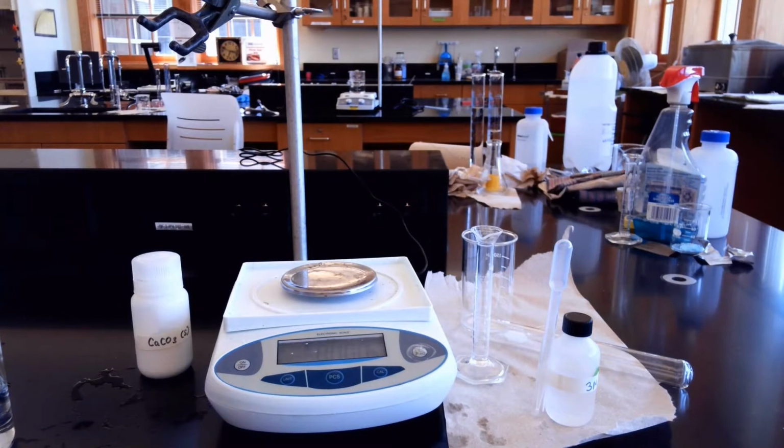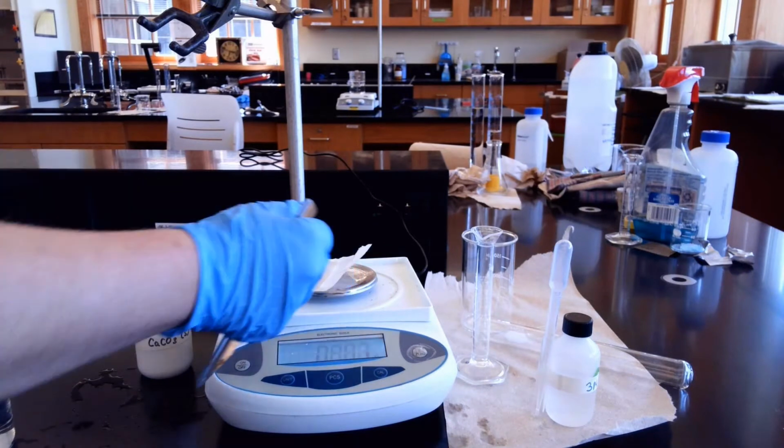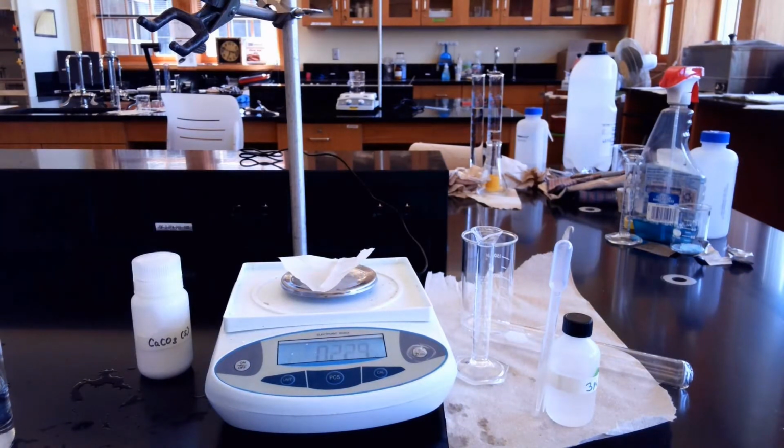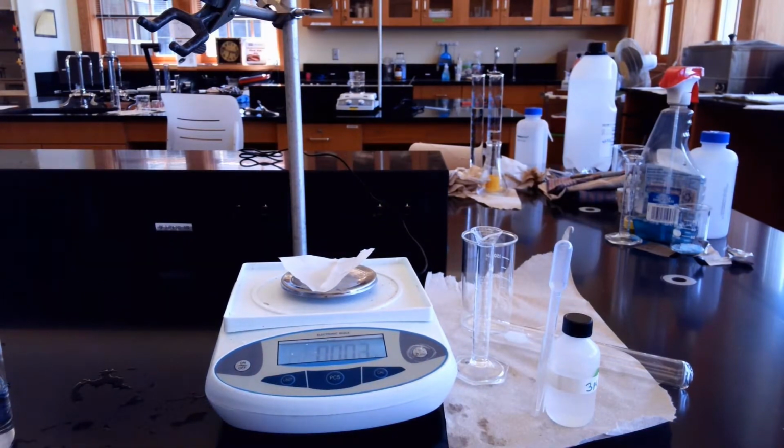What we are going to do now is prepare our gas generator. So the first thing we have to do is measure out the amount of CaCO3 we need. So we're going to put a piece of weigh paper on. We'll give it a second and we're going to tare it. And we're looking for about 0.26 grams, anywhere over there.